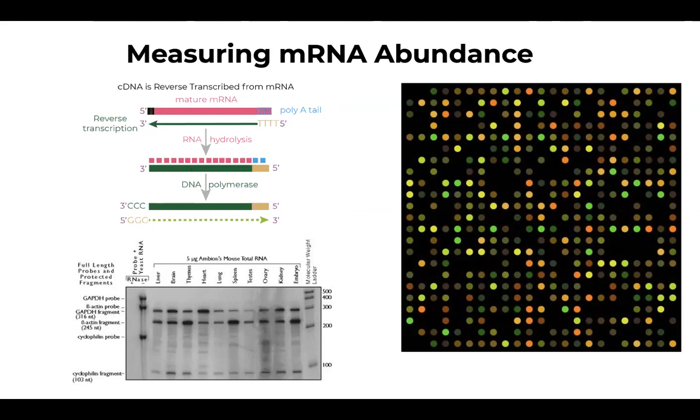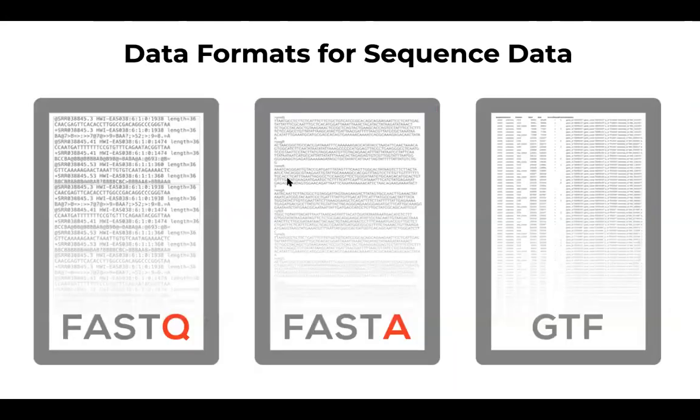The advantage of next generation sequencing is that we get the exact sequence of short reads. And so when we look at the sequence of those reads, even though they are short, by mapping them onto a reference genome, we can identify many different things from a single analysis.